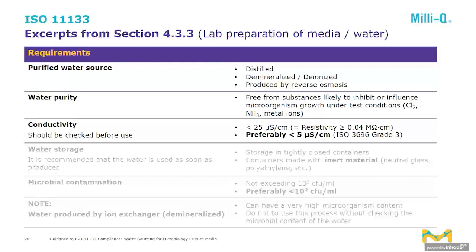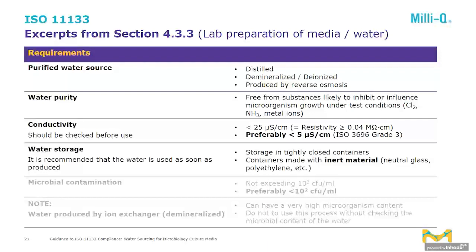And the other important point is that conductivity or resistivity should be checked before use. Why? Because as purified water is kept, is stored, its quality may degrade with time. And this is also the reason why water storage is mentioned, because the best way would be to use freshly purified water. The more you wait, the more you store water, the more you have a risk that it will become contaminated. And that's the reason why it's important to store that water in a tightly closed container, and also in a container made with an inert material that will not contaminate the water. So either glass, good quality glass, or polyethylene, for example.